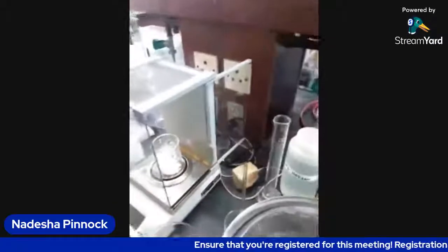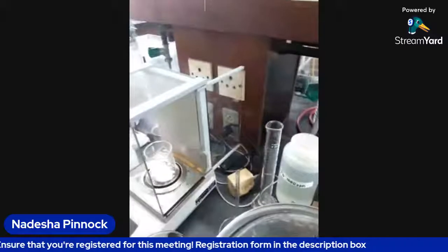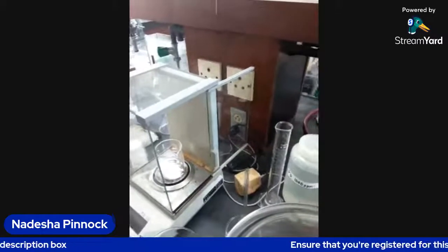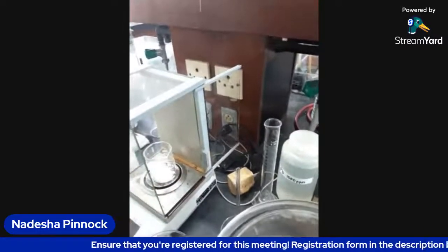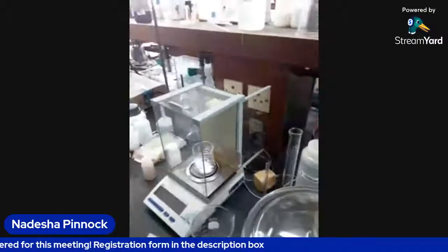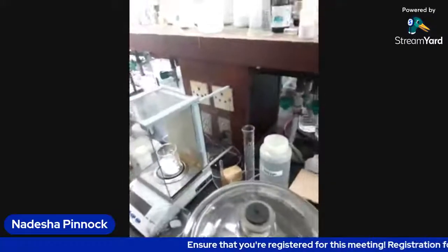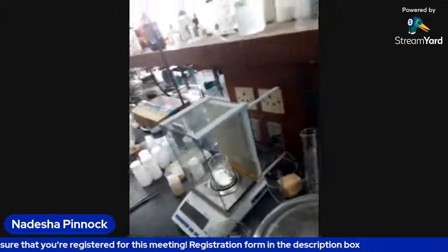All right, so we're at 9.68. Almost there. 9.97. Just a little bit more. So here's a thing about weighing. If you need 10 grams of something, usually you can go about 10.1 or so grams. That's good.